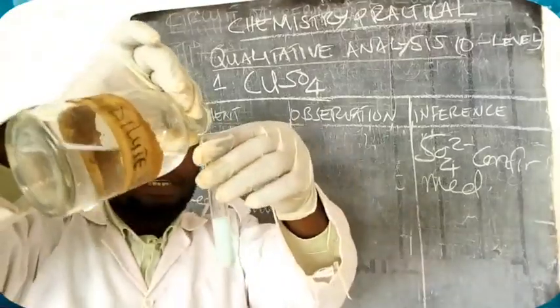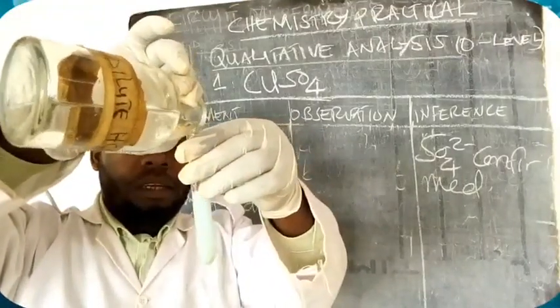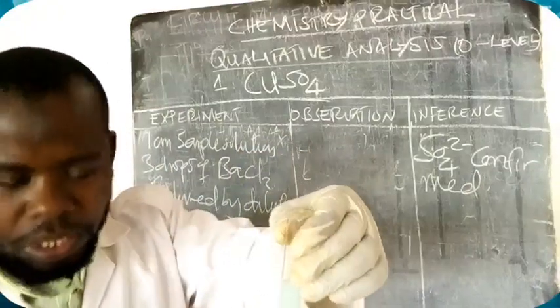Then we add acid and it is still insoluble.